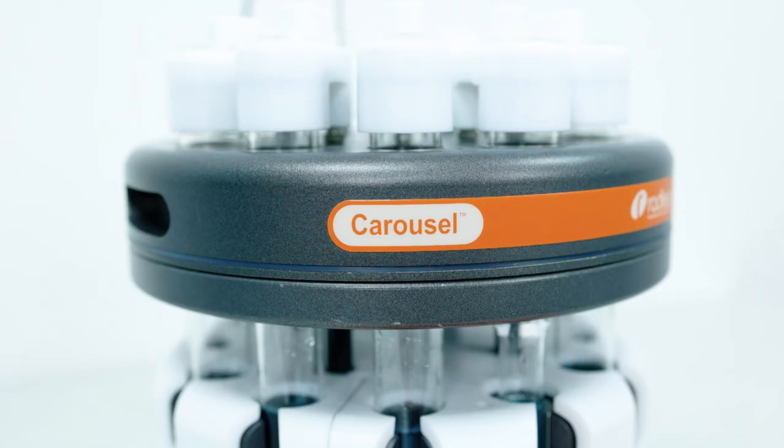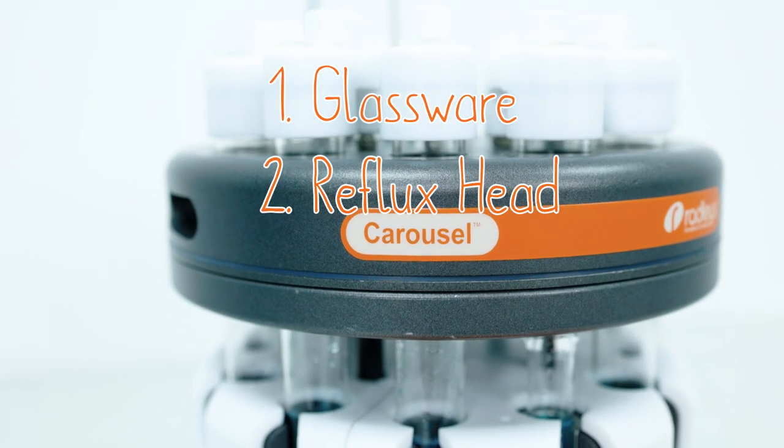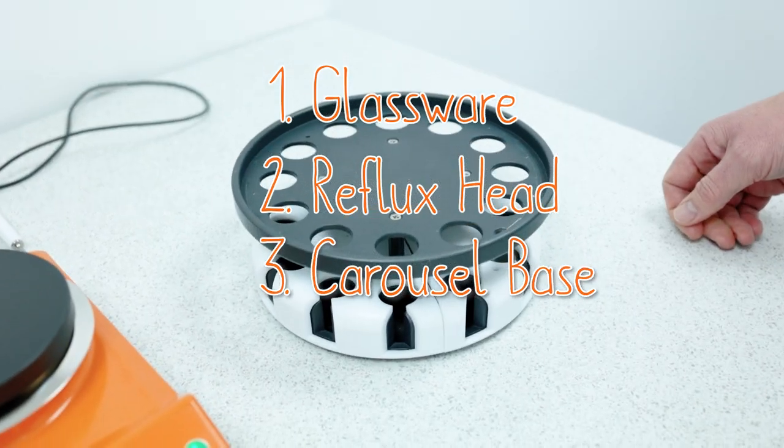The Carousel 12 Plus is built of four main components: the glassware, the reflux head, the carousel base, and the hot plate.